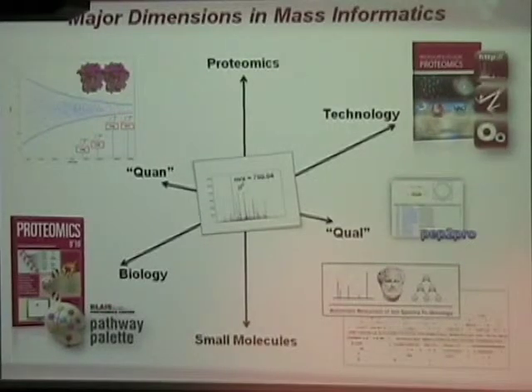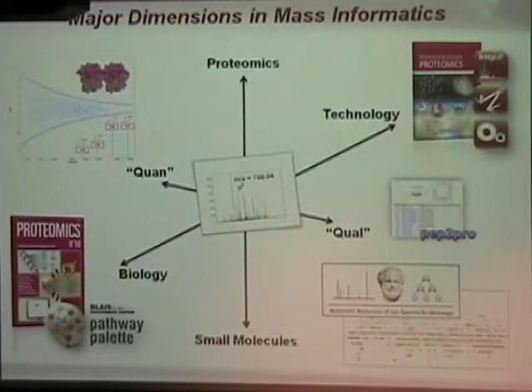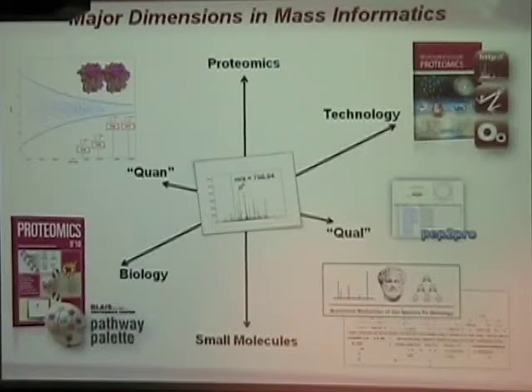Okay, so in order to demonstrate some more of these tools, we're going to need to look at a biological experiment. And so I'm going to start by setting up one of these experiments. Unfortunately, to show off a broad set of these tools, it's quite a complex experiment, both biochemically and in terms of how the experiment is run in the instrument.